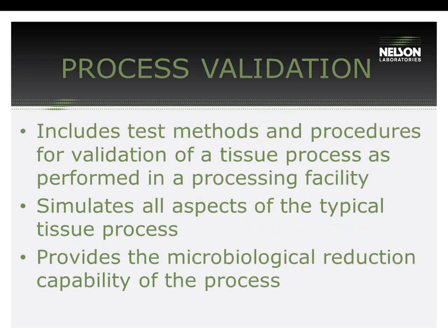To go over some points that Martel specified, process validation is a term used to validate step-by-step methods and procedures that are used to process products like tissue. Most of the process validations are performed in-house by the tissue banks, but if a facility is interested in testing their procedures through a third-party testing lab, they would have to provide all the steps that are performed for the processing. By contracting a lab to perform the testing, it not only gives you a microbiological process, but gives you how well the tissue process is performed by testing every step of the process.